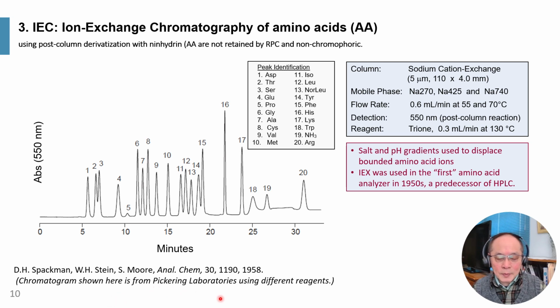shown by Pickering Laboratory using different reagents or buffers, different columns, and also a different derivatization reagent. Here are the column and operating details.